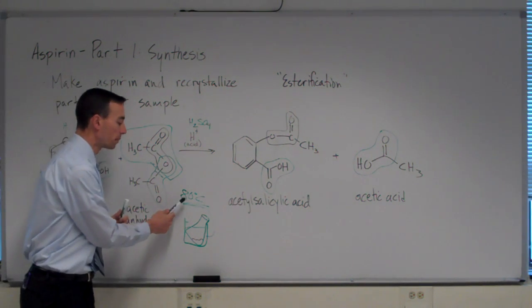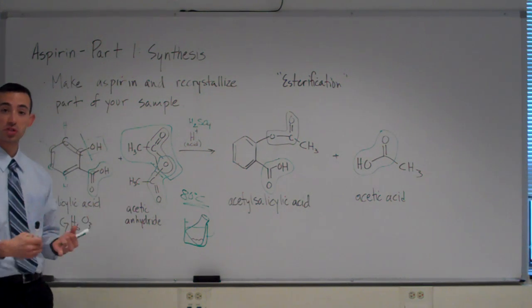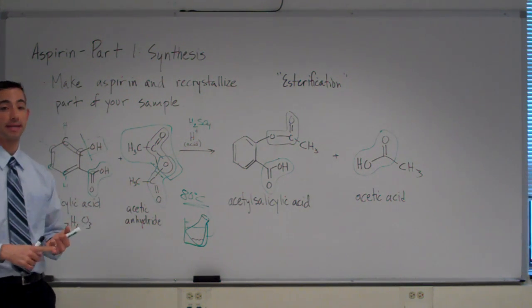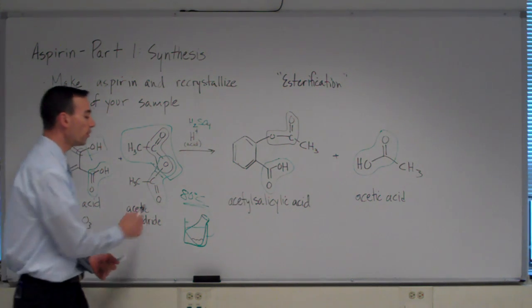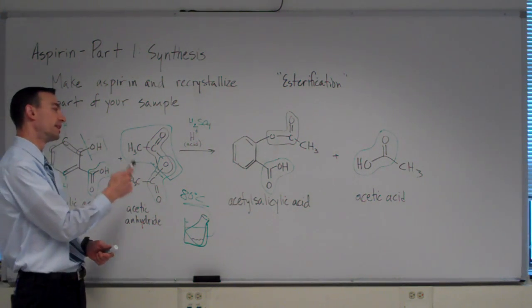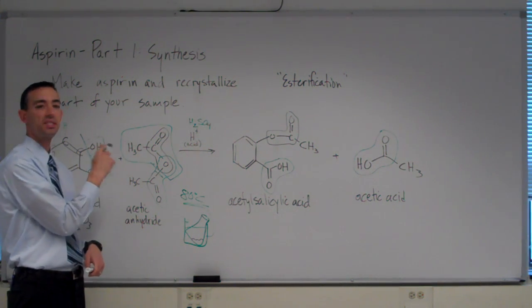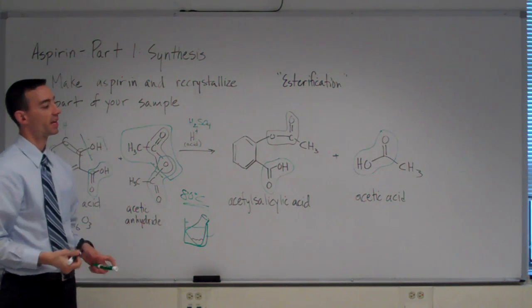If we go lower than this, the reaction still occurs, but it occurs more slowly based on what we know about kinetics and temperature increasing the rate of a reaction. And if we go above this temperature, we actually get into a danger zone for decomposing some of our materials that we have, and then we wouldn't get the esterification reaction.